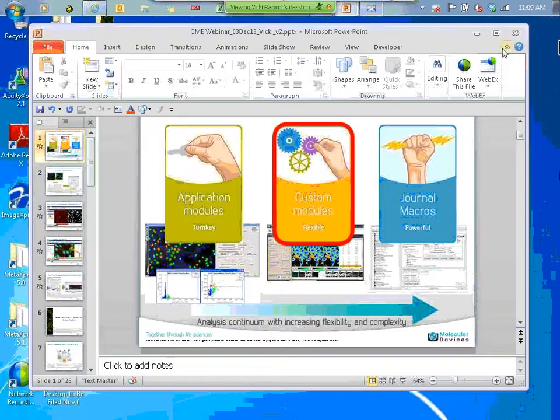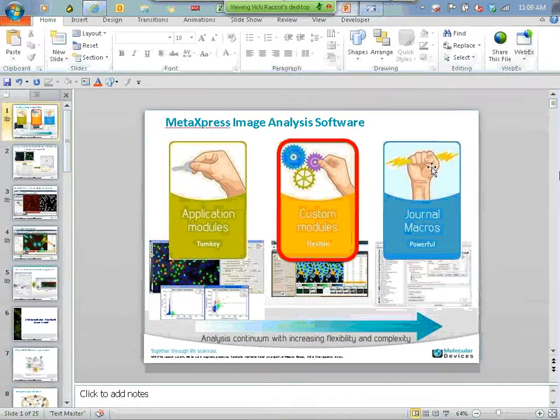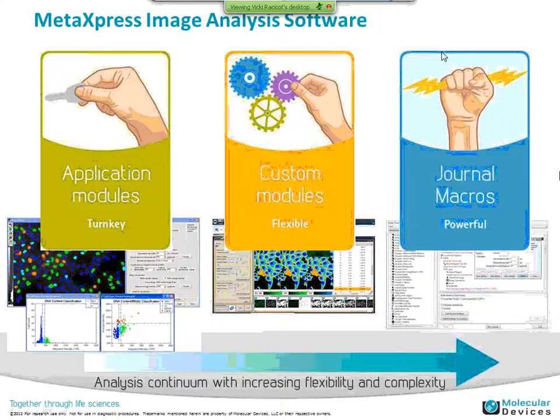As Grisha very nicely illustrated, the high-content screening approach can add value to your drug discovery campaign, enhancing the capability to eliminate toxic or non-specific compounds very early in the drug discovery process, reducing attrition later on when it's much more expensive.